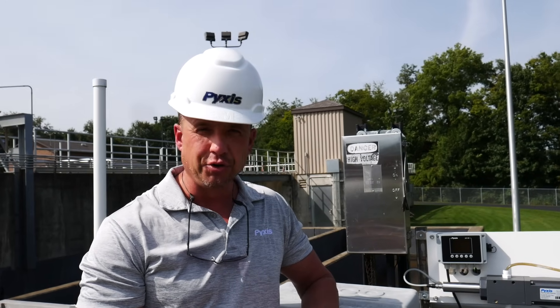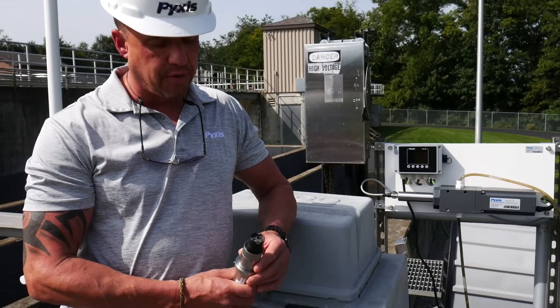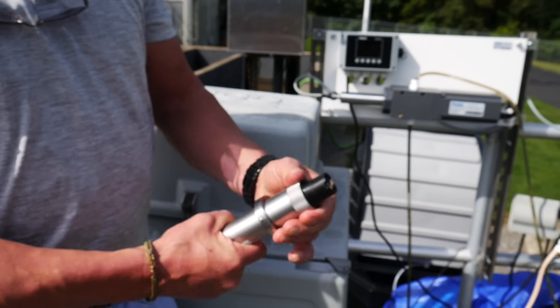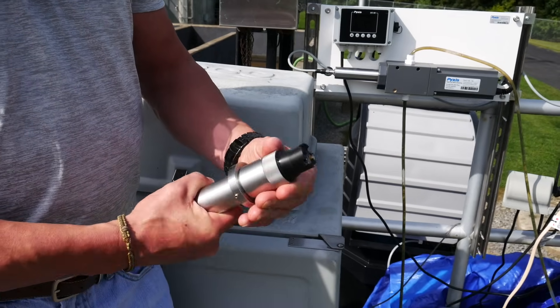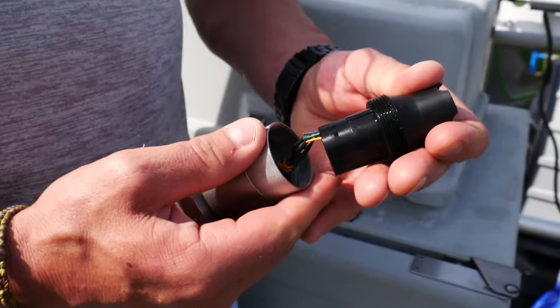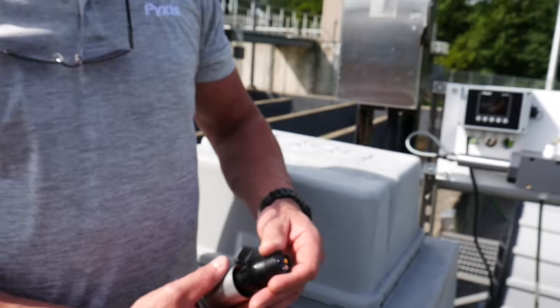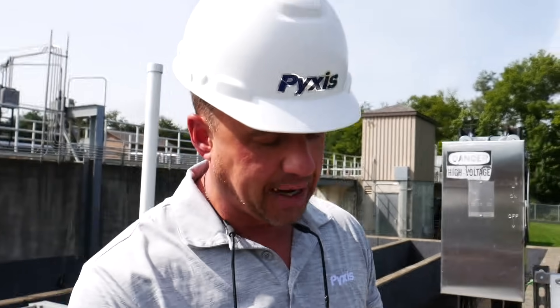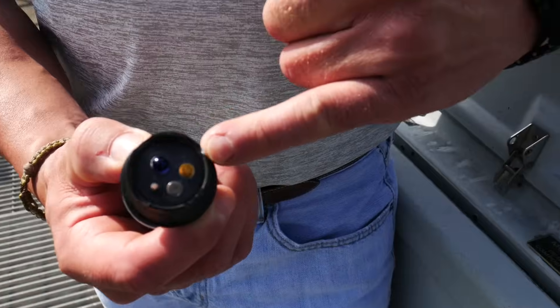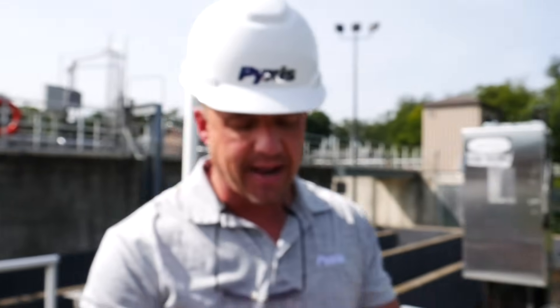Another unique feature about this sensor is that the entire electrode head assembly is removable and replaceable. We expect about a two-year lifespan out of the electrode head, and it's very simple to remove and replace simply by unlocking the coupler, unscrewing the head, and when fully unscrewed you'll see the entire electrode head comes off. Within this electrode head is the bare gold electrode as well as the pH and temperature monitoring, and the electrolyte solution gel is actually encased within the head itself.